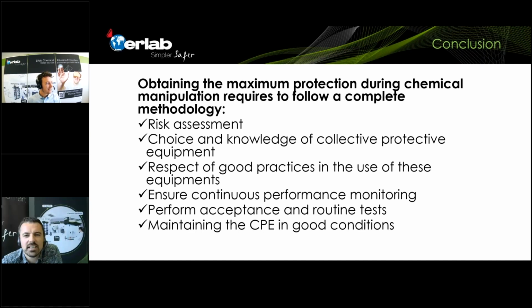So I think you can now see both of us. I hope so. So thank you, Lorraine, for this presentation. We do have questions actually that we had during the presentation. The first question is from Vrindrich Vidanes. Sorry about the spelling and the pronunciation of the name. What type of biological safety cabinet do you have?